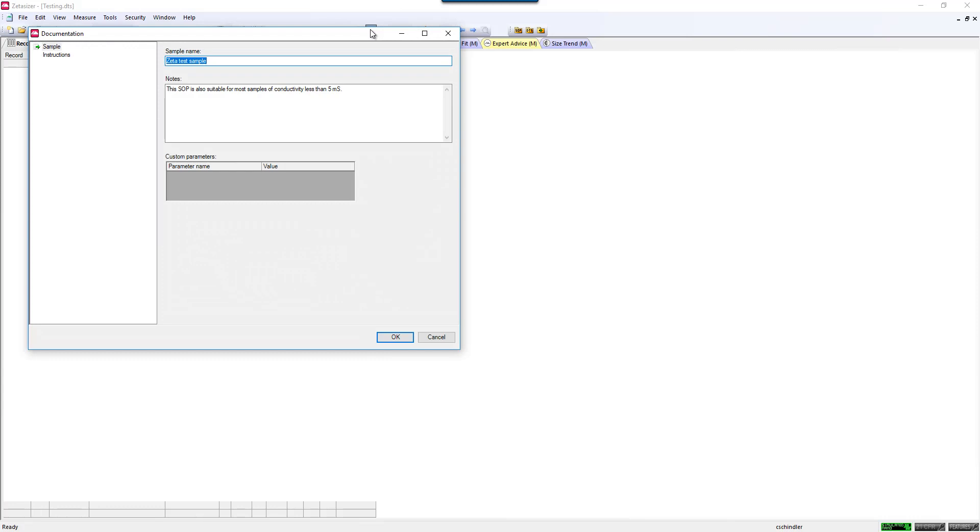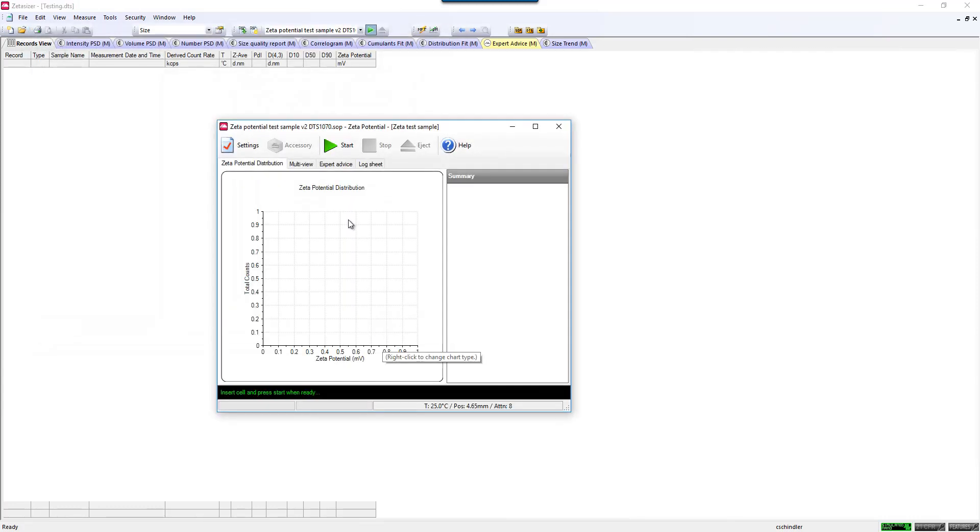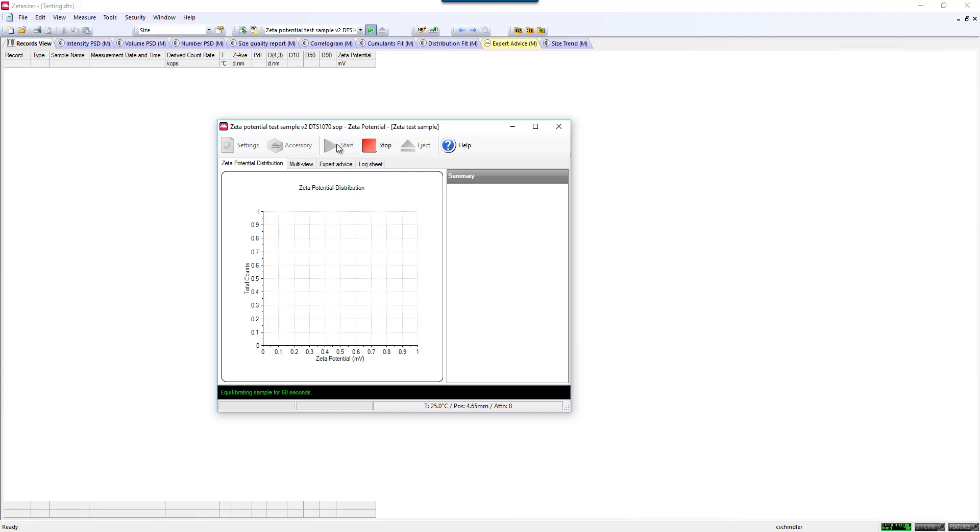You would then be prompted to enter in your sample name, and then click OK. You can insert your cell into the instrument, make sure that it's oriented properly and clipped into the electrodes, and hit Start.